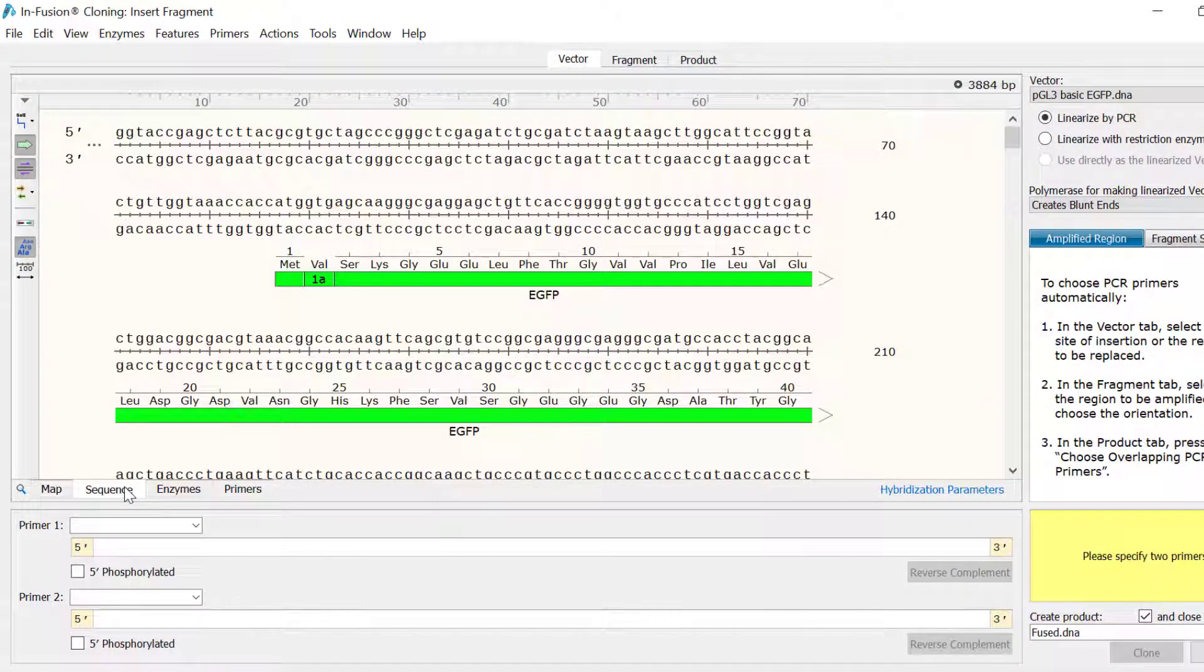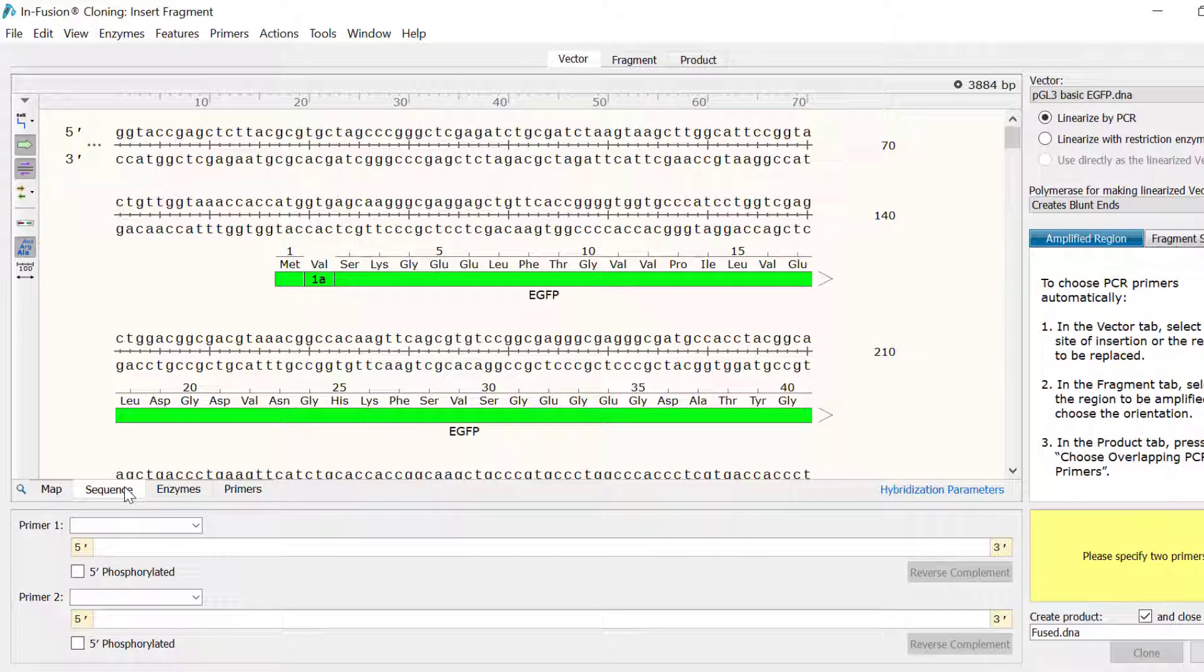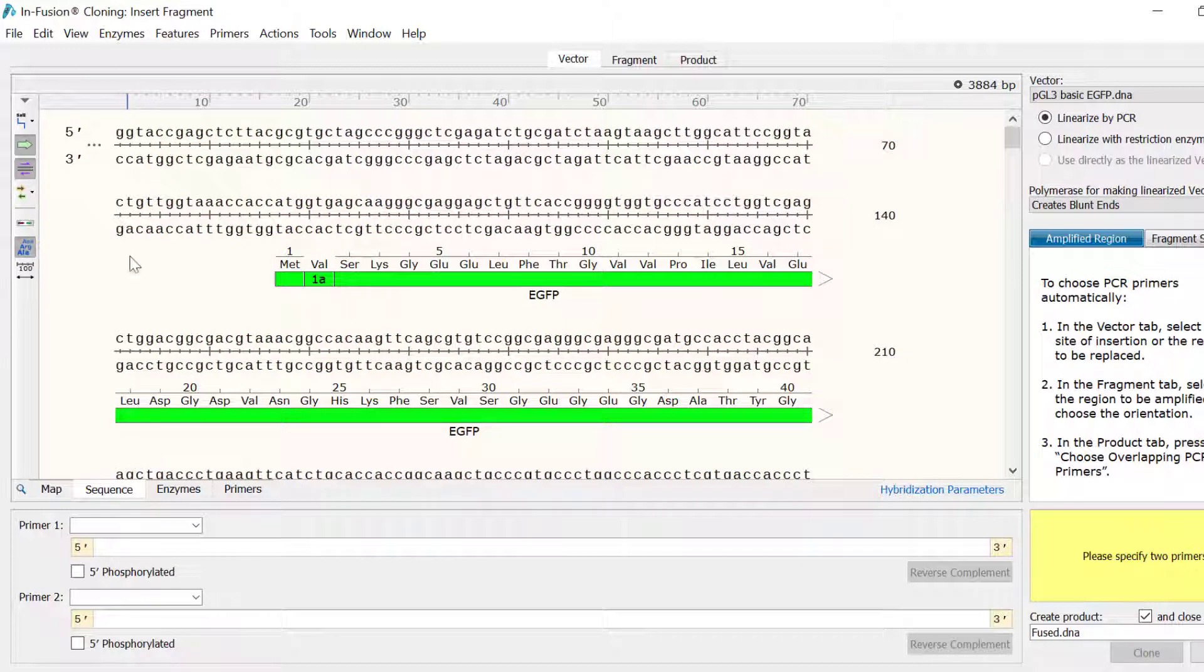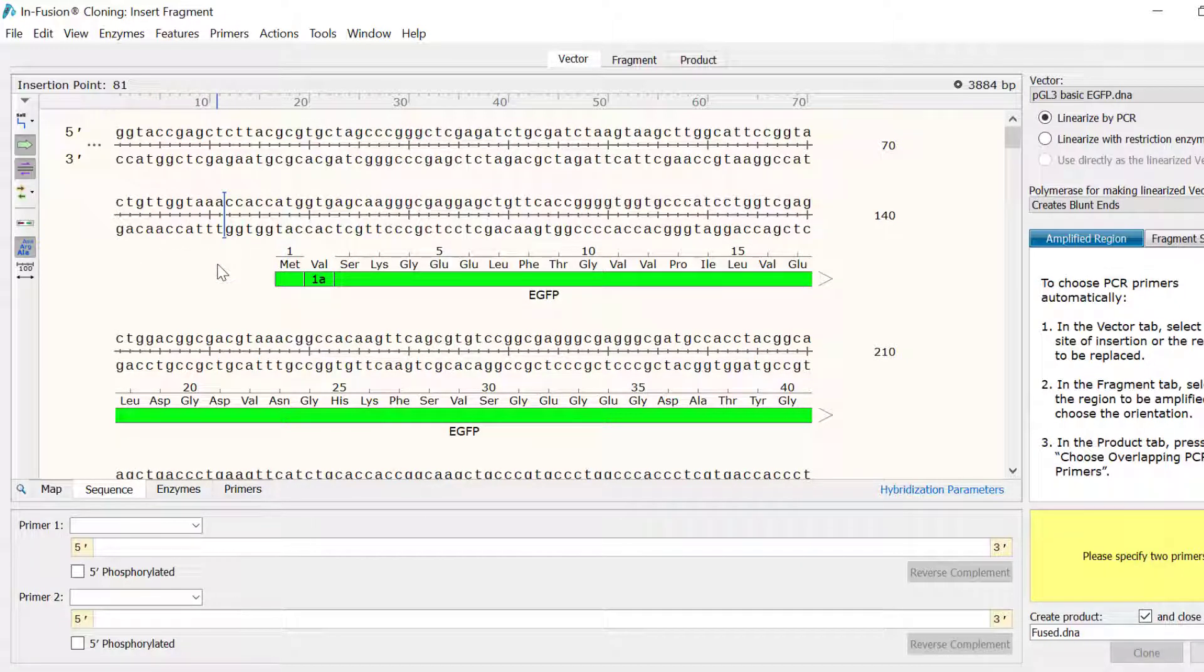Since this product will be used in a reporter assay, I want to insert my fragment just before the GFP gene. To insert a fragment, simply move the cursor in between the desired bases and click.